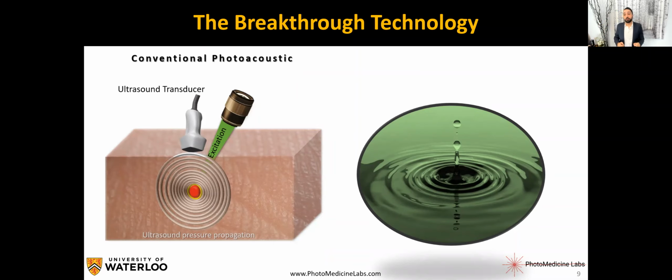So now imagine you are at that exact moment that the stone hits the surface of the water and you detect that initial pressure, those shock waves, then you are dealing with orders of magnitude higher pressure compared to the time that you're waiting at some distance for the sounds to basically decay and propagate, and then you detect much, much less pressure.